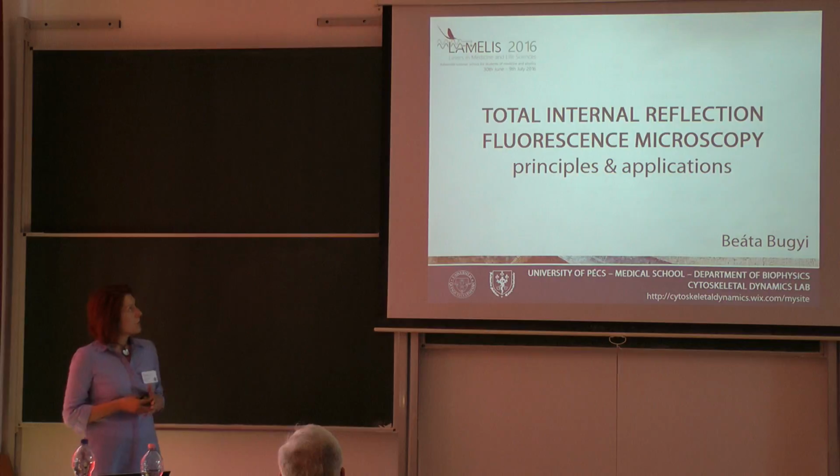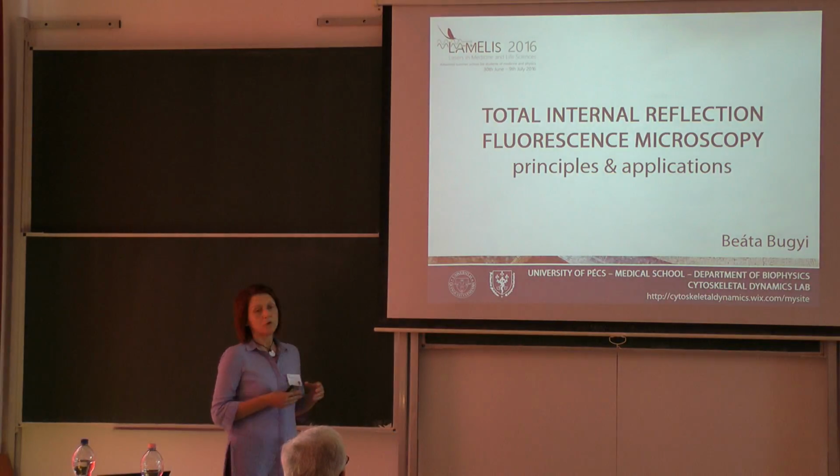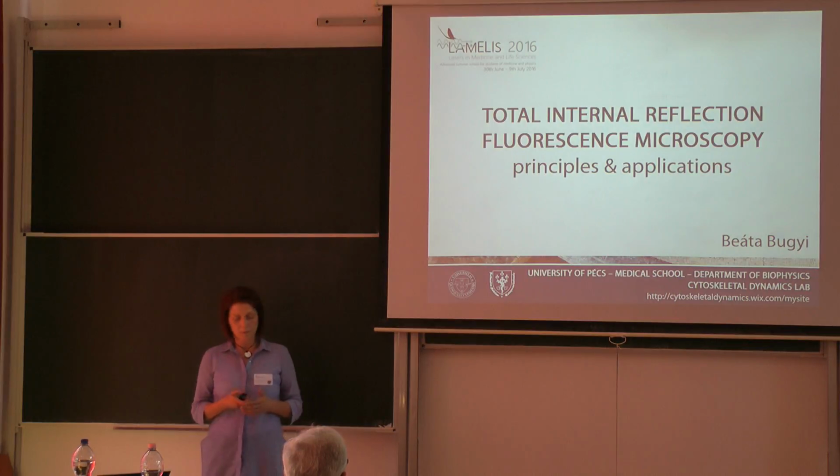And actually the use of total internal reflection in fluorescence microscopy was one of the earliest ideas behind what we call today super resolution microscopy imaging.